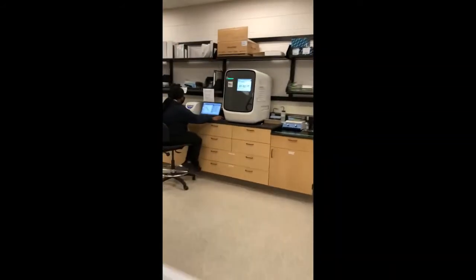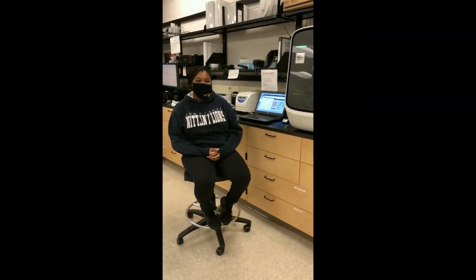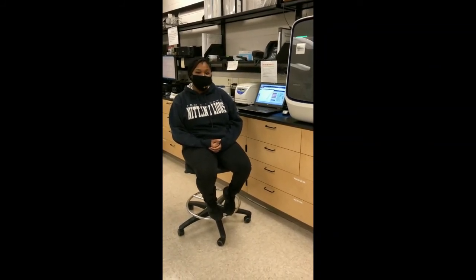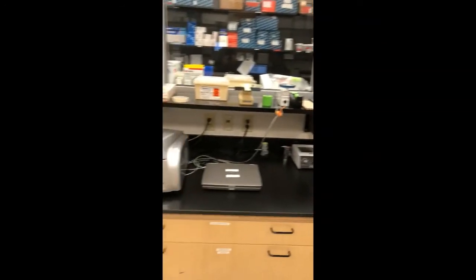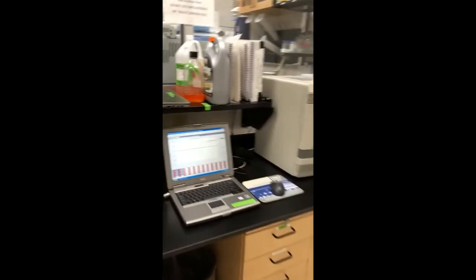And now we'll go over to the second side of our laboratory, which is anything after we amplify multiple copies of DNA. I'm Chastin, a second year PhD student, and my research is focused on developing a mixture detection assay to be used at the quant step that will be used on evidence items to determine if they contain DNA from one person or from multiple people.